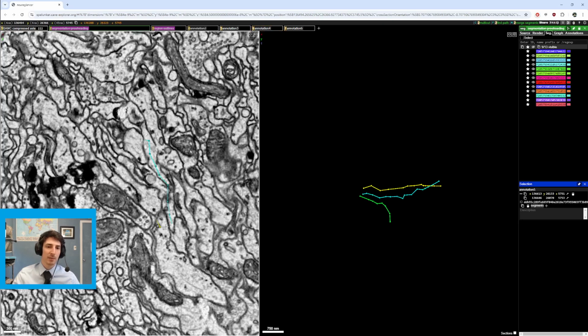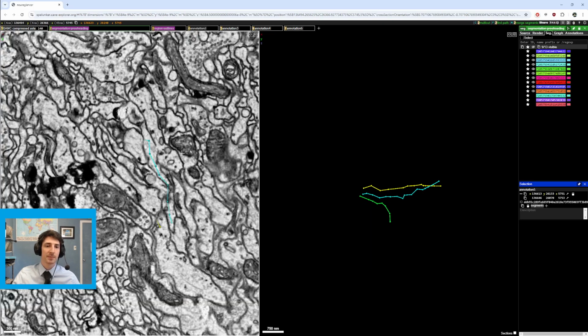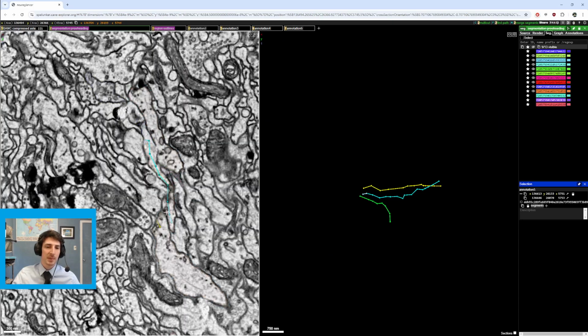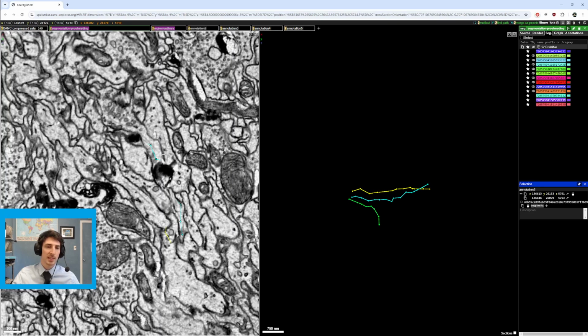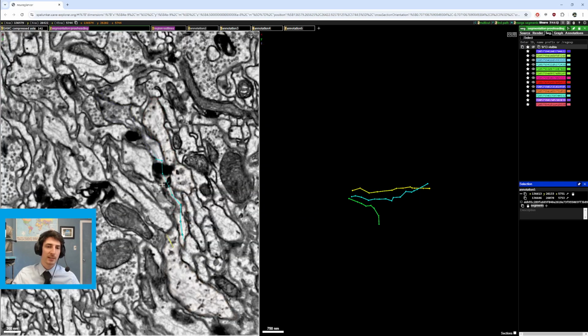And like we said earlier with the yellow one, using the larger, more intact areas as a guide visually can help you draw the path through an error, especially in these parallel plane mergers and damage slides. So let's turn the segmentation back on. As you can see, this path is a little bit skewed, so it'd probably be more like that. But since the annotation points are just a guide, they don't need to be exactly perfect.